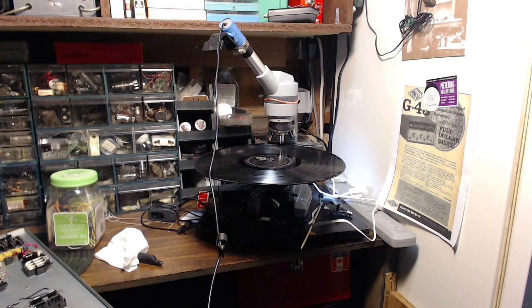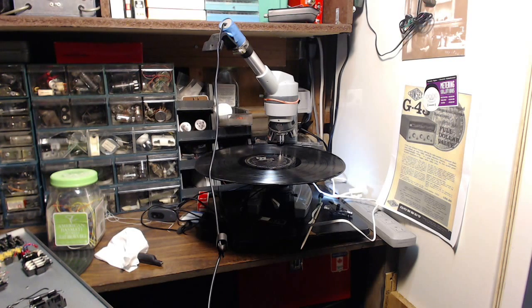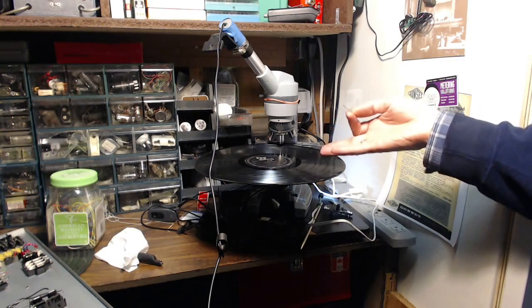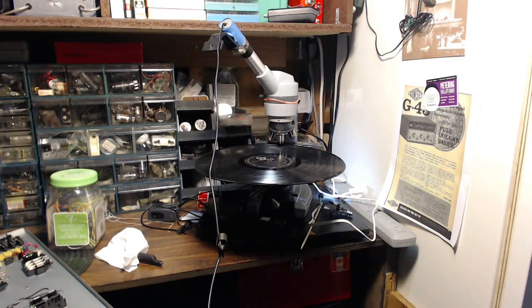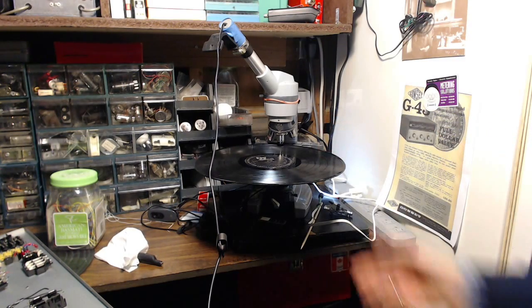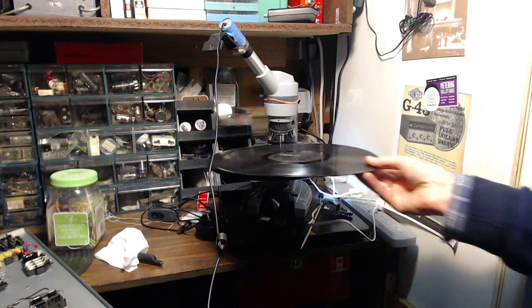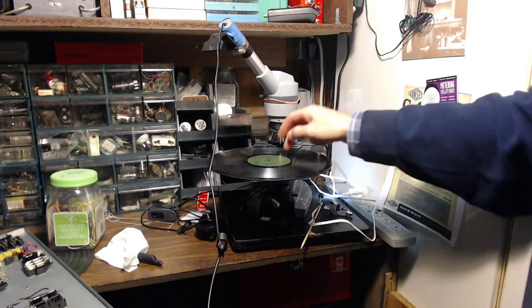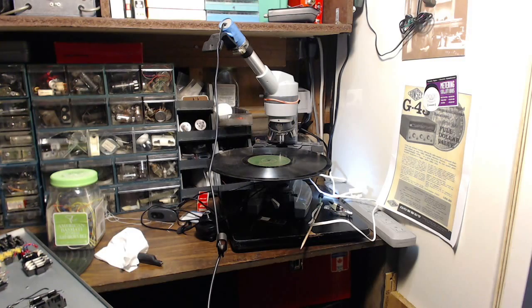So I just got curious about looking at a record under the microscope and I thought wow it'll just take me a couple minutes to get that set up. So I went ahead and did it and you can see under the microscope is a record here. In fact there's two records, there's another one there. So that's an old 78 record.